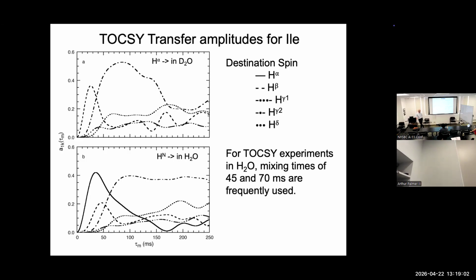What I got really interested in... years of his life, but I just remember all these end effects, you know. Yeah. So, for example, in the valine, as I said, the magnetization ends up on the methyl groups very quickly.